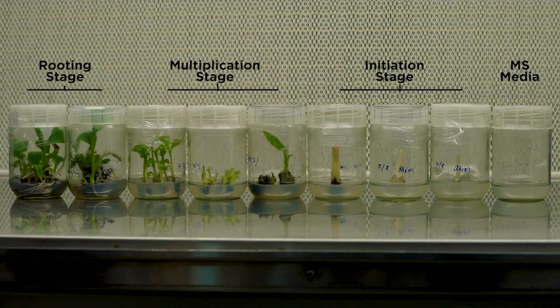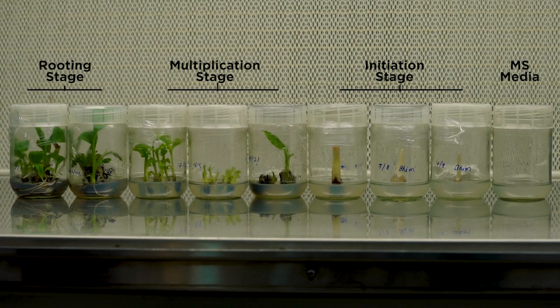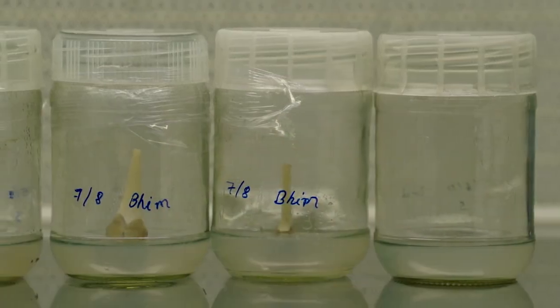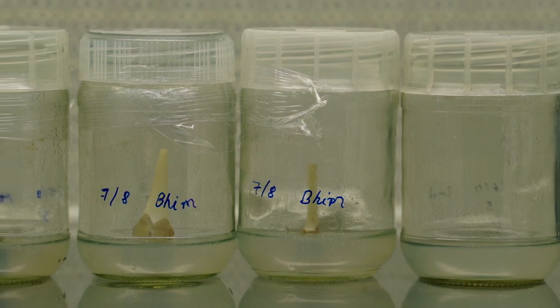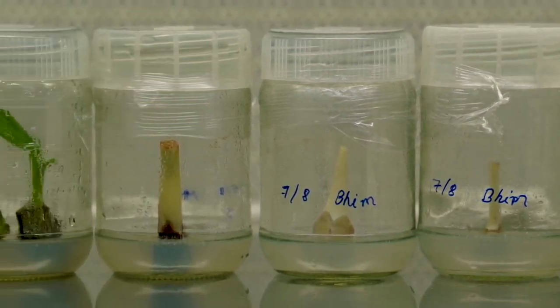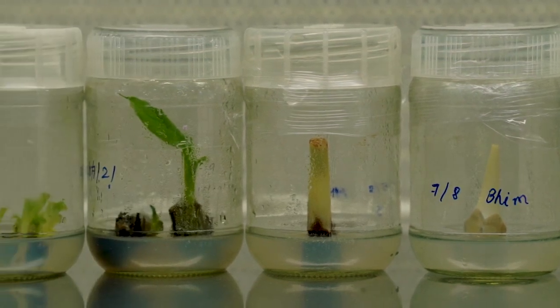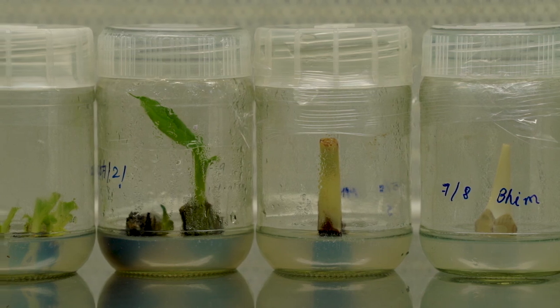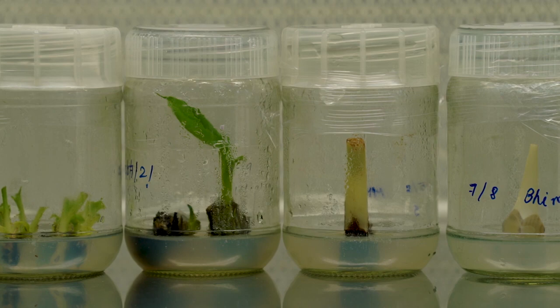Now we will show you the different stages of micropropagation. As I have already said, micropropagation has 4 different stages. Stage 1 is collection and inoculation of the shoot apical meristem into the media. Stage 2 is multiplication. Stage 3 is root proliferation. And stage 4 is hardening.